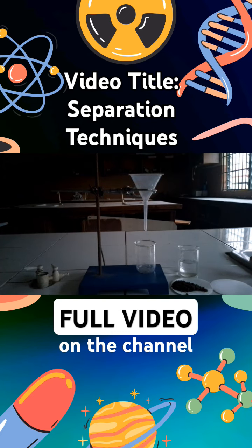Now, what are we trying to do? We are trying to create a mixture of this sand and water. And then when we mix the soil and the water together, we are trying to separate the sand from the water. So we are trying to separate the mixture through a process known as filtration.